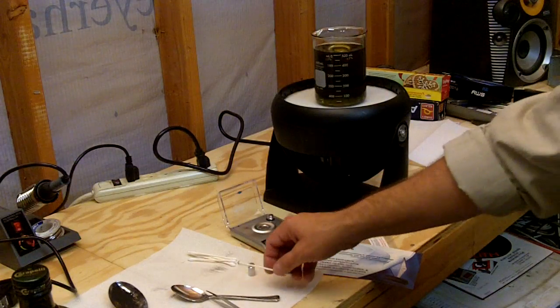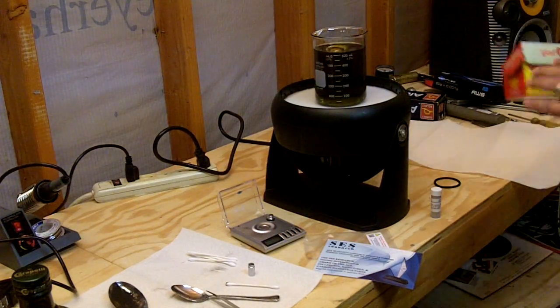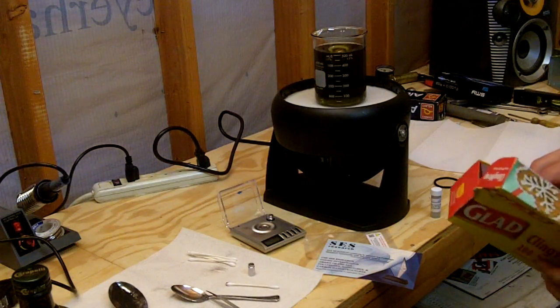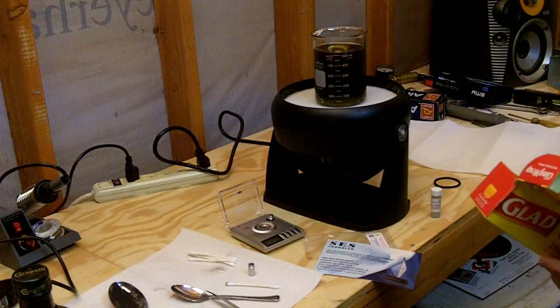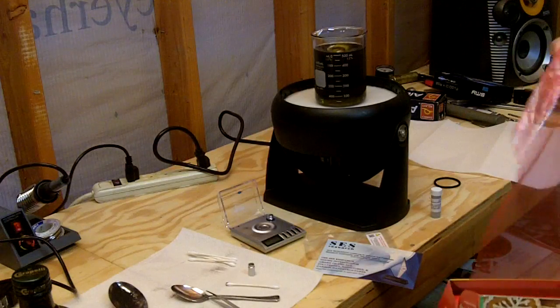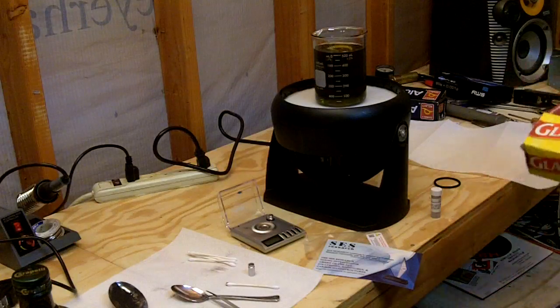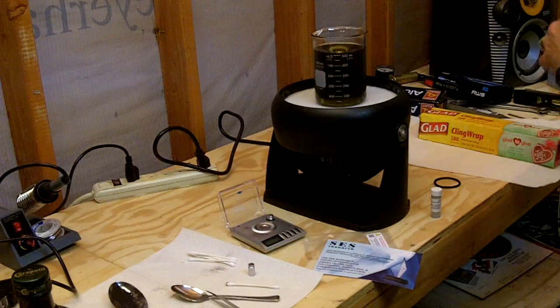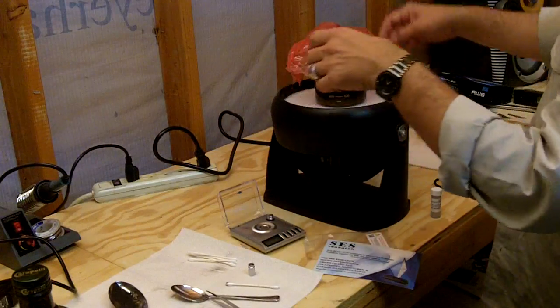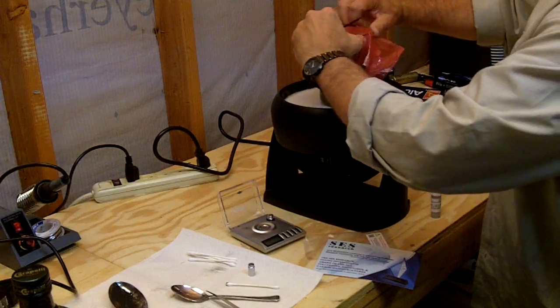Now I'm going to cover it with some plastic wrap to keep it from getting exposed to dust or anything else in the area. And I'm just going to cover it with a little band.